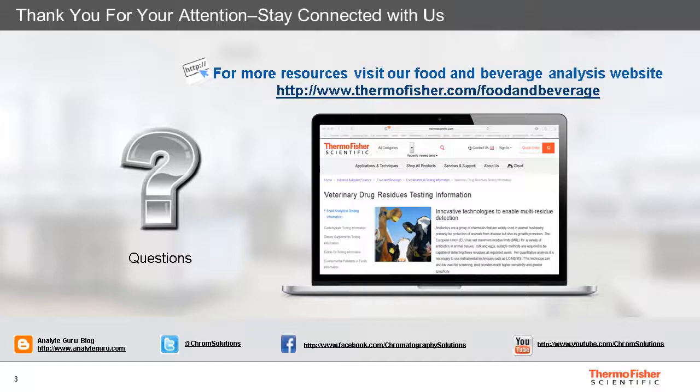And you can decide whether you want to just flush it with water, or whether it's necessary to use a very weak acid, but we can provide advice on that. And you should do it at least once a month anyway in order to rehydrate the suppressor in order to get the optimum performance. Other things we do, inject a small volume of organic solvent, for example 2 microliter of acetonitrile, occasionally into the system to just make sure you clean the tubing, and also helps to clean the column as well.